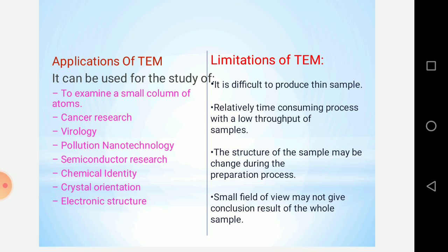Virology: you must be very aware at this point of time, because everyone is talking about corona. We can see the minute structure, every crown, every detail of that particular virus by using this transmission electron microscope, which is impossible with a simple or light microscope. We can't see viruses with a light microscope because they are very small, but with the transmission electron microscope we can see the minute details of the virus. So it is used in virology.